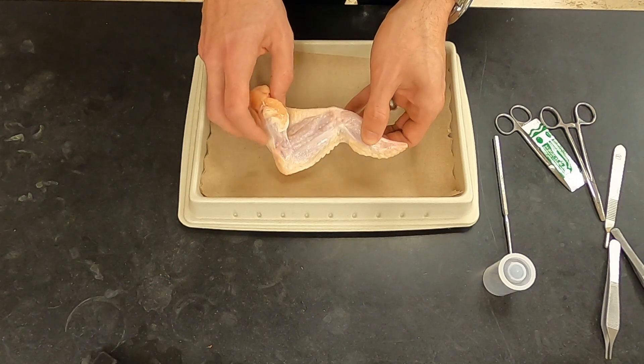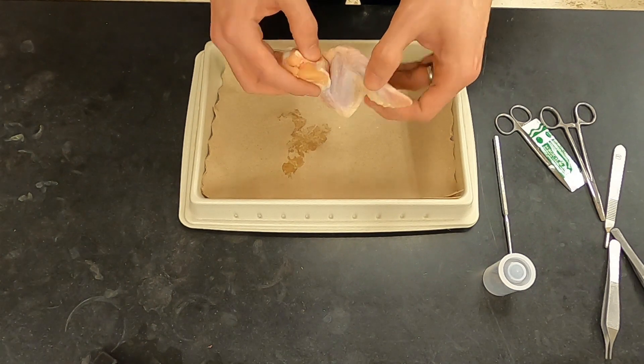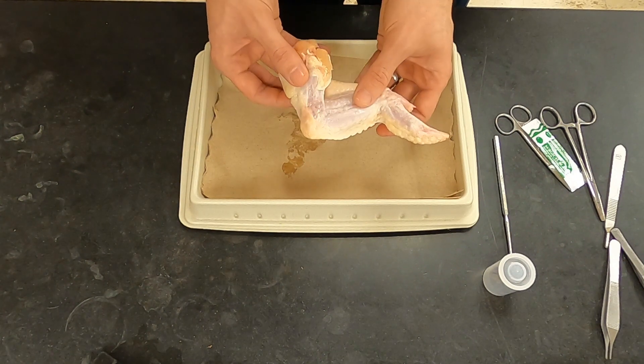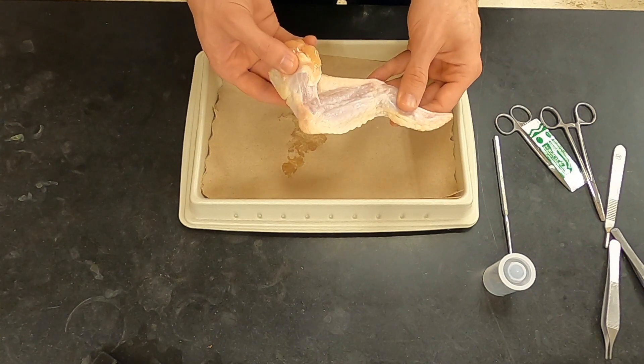This is a left wing. It would attach to the body of the chicken here. This is the lateral or outer side — it's got thicker skin — and this is the medial side, where the skin is much thinner. This is the side where we will focus because it has more of the muscles we will be looking at.